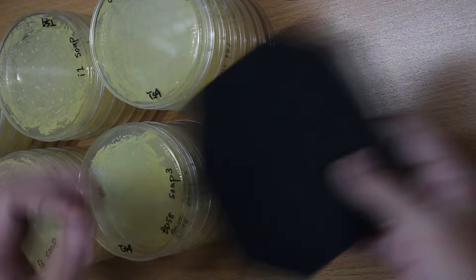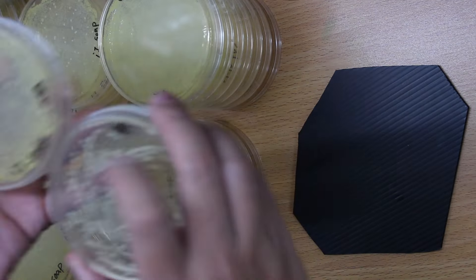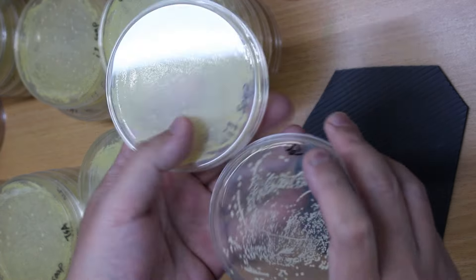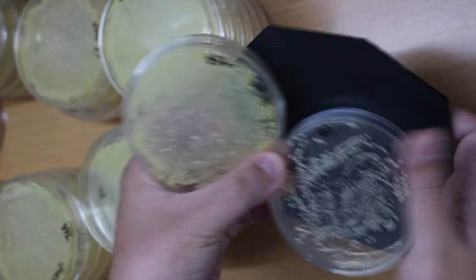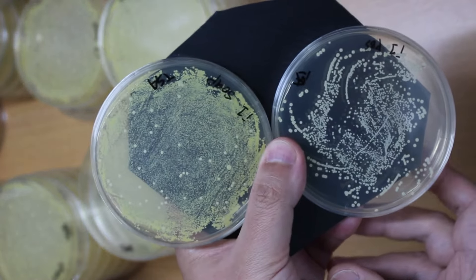And for some bacteria, you even got more of them. The soap treatment just seems like it increased the bacteria load.